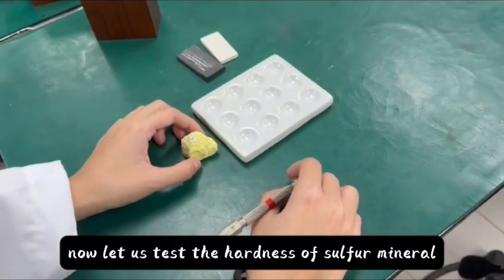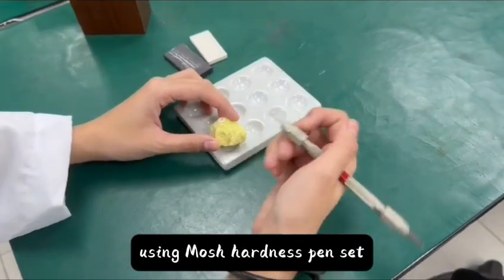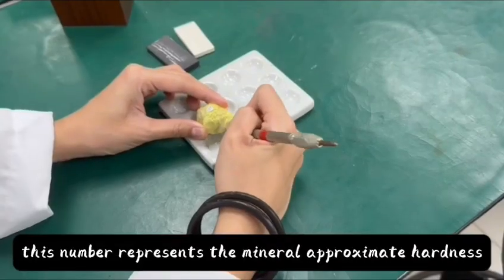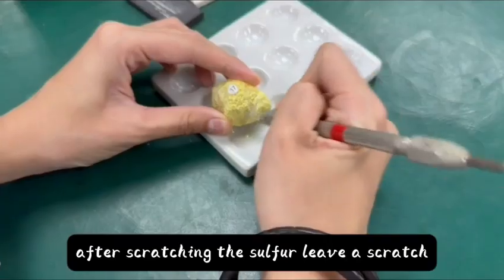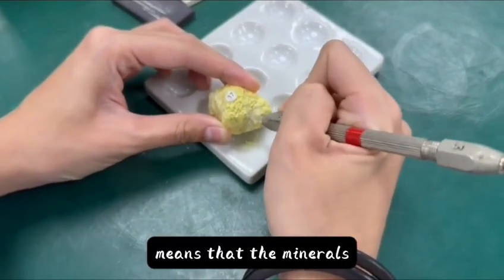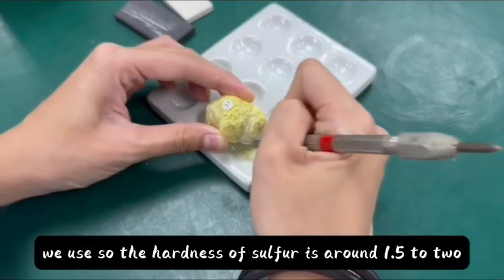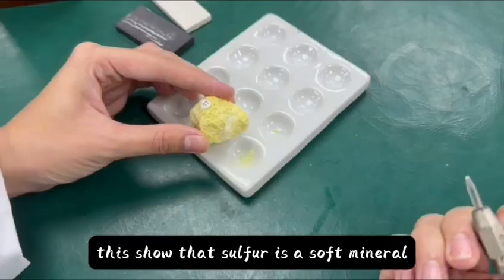Now let us test the hardness of sulfur mineral by scratching the mineral using the Mohs hardness pen set. I start scratching the mineral using the pen labeled with the lowest hardness point, which is 2. This number represents the mineral's approximate hardness on the Mohs scale. After scratching, the sulfur leaves a scratch. When a scratch is made, it means that the mineral's hardness is lower than the hardness point we use. So, the hardness of sulfur is around 1.5 to 2. This shows that sulfur is a soft mineral.